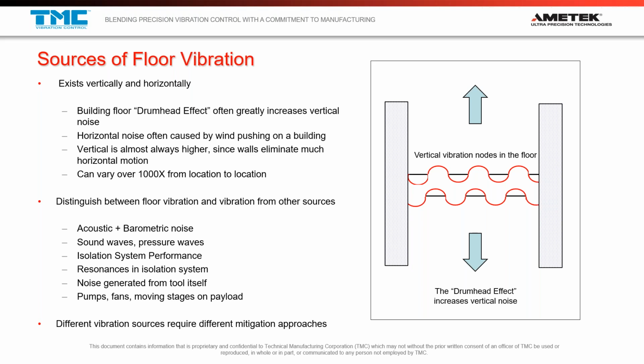Something like that might be caused by an elevator going up and down a shaft, which is going to move a whole lot of air through the building very quickly and cause a suction that could cause a wave and a pressure change in a room. There are other things you're going to be watching for, like resonances in the isolation system. I'm not going to spend too much time talking about passive systems, but you have active systems and passive systems. And you might have an isolation system that is even built into your microscope.